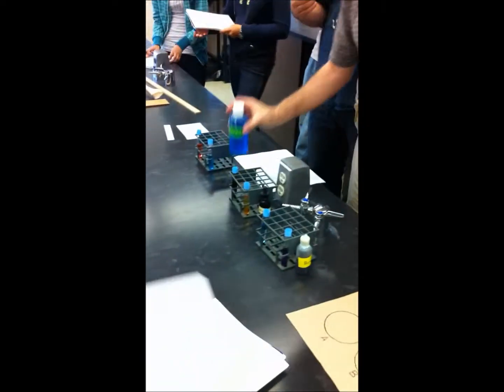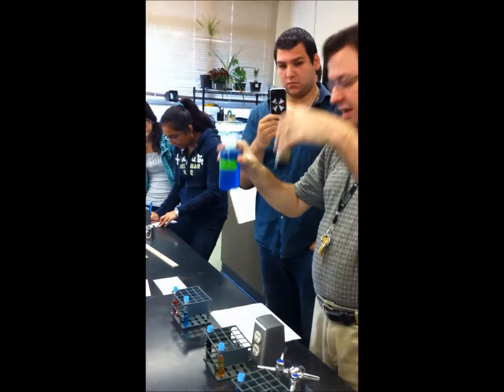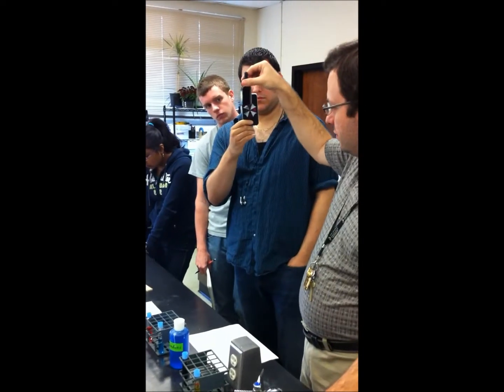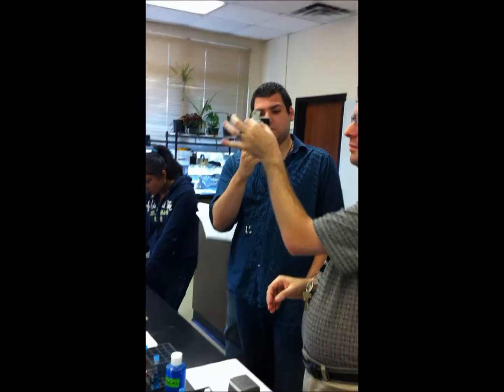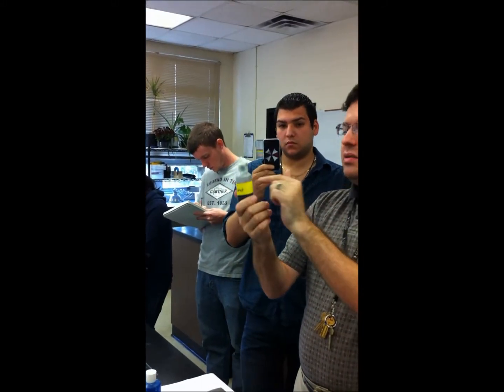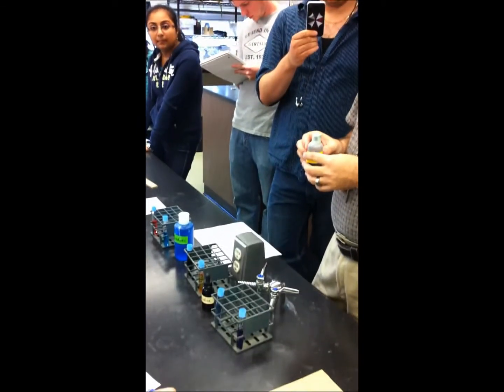Now, remember I told you when we were doing this lab, you need to memorize what the reagents look like on their own, okay? So you need to be able to tell Benedict's, iodine, and biuret. Okay, you may be given a bottle of this with the stuff in it, with the label off, and they'll ask you which reagent is it, and what is it testing for.